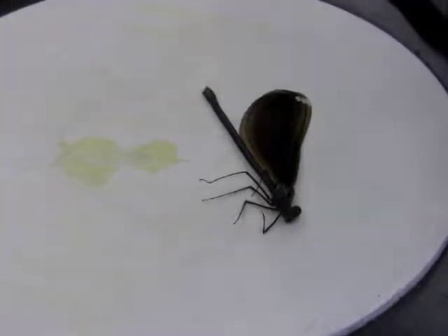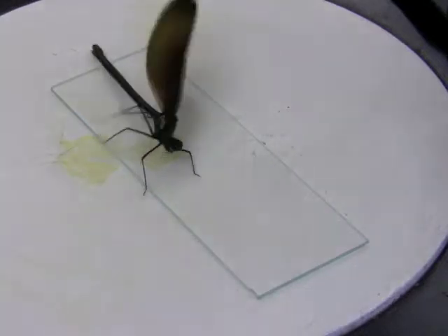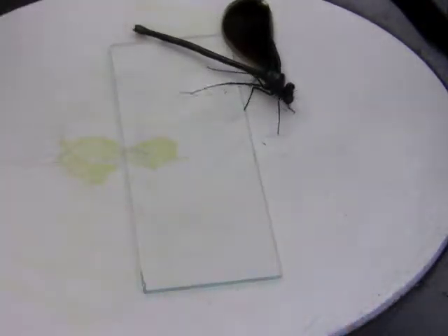To begin, we need a damselfly that's been in the fridge so it doesn't move around. We need a clean microscope slide. This damselfly might move around a little bit.